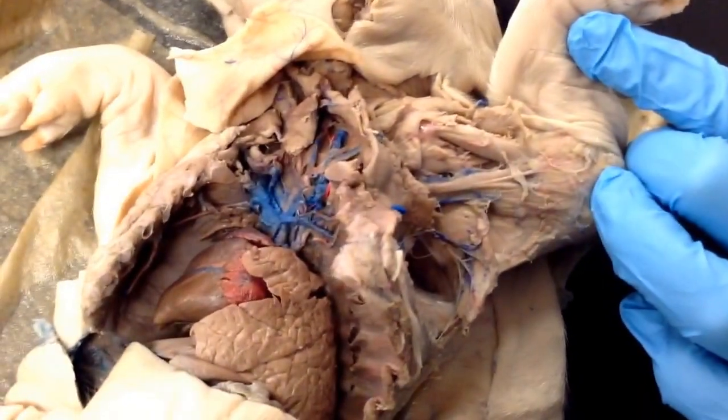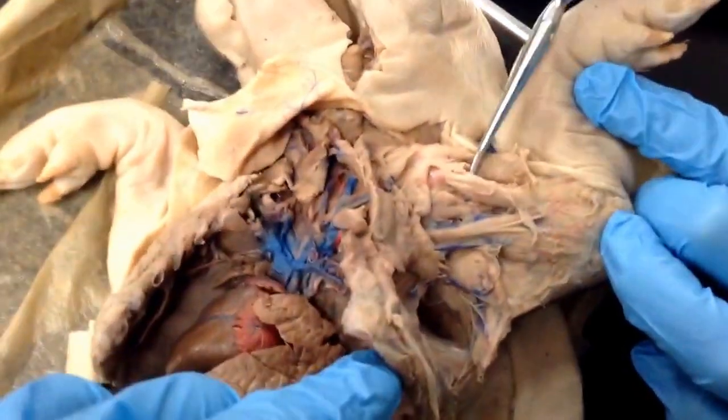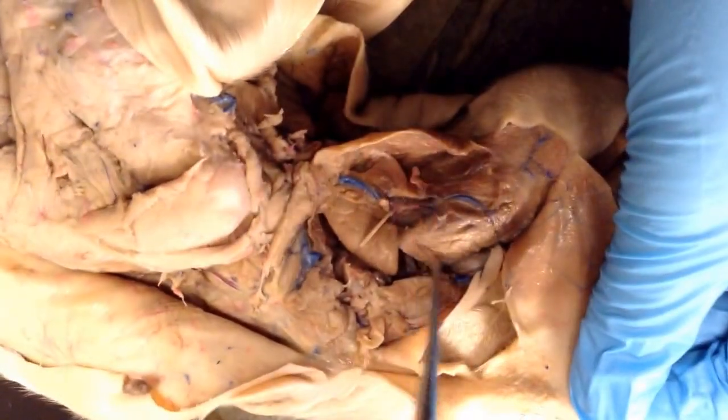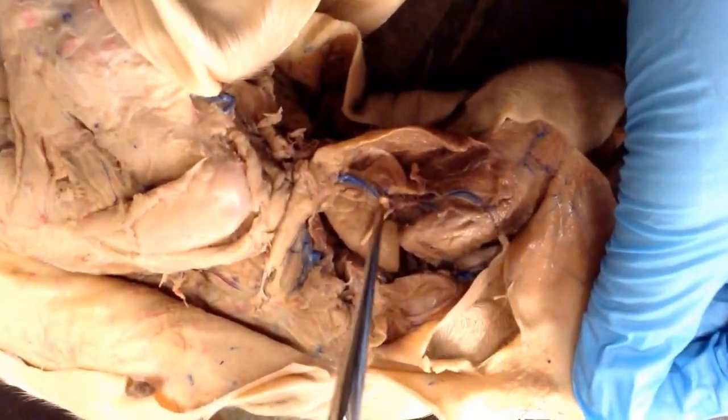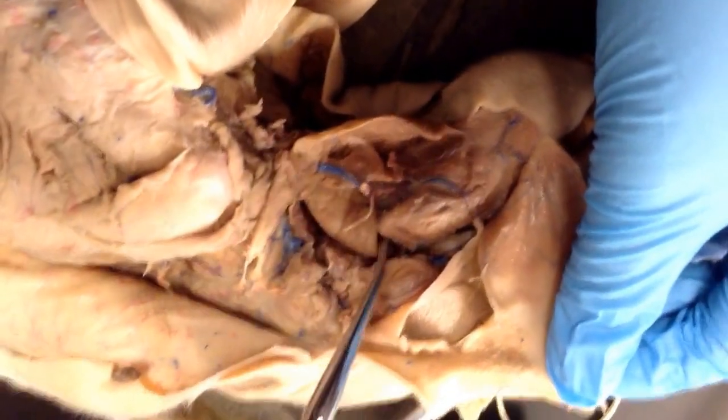So the pectoralis major was a muscle that had already been bisected, but that was somewhere in that area, and that's the biceps. Little white stringy thing is the facial nerve. So this is the ventricle. And that right there is the masseter. And that is a little lymph node. And that's the mandibular gland.